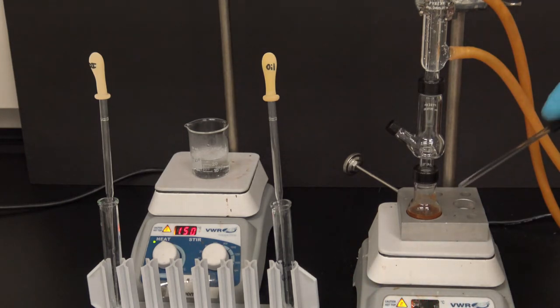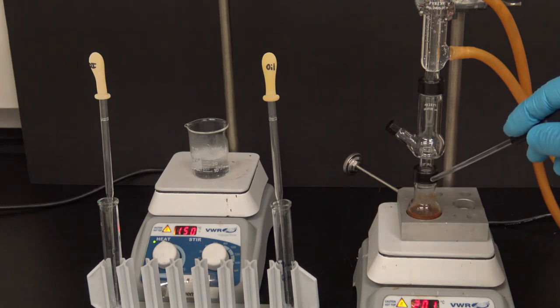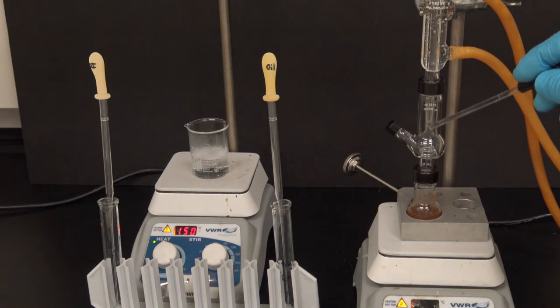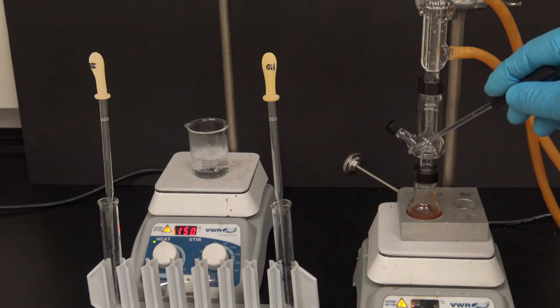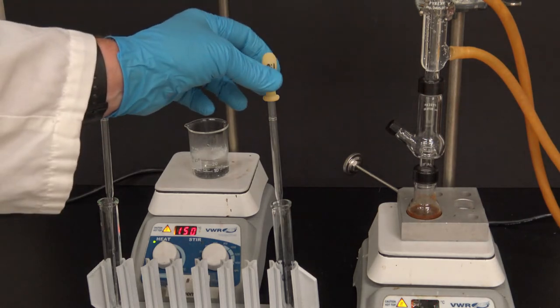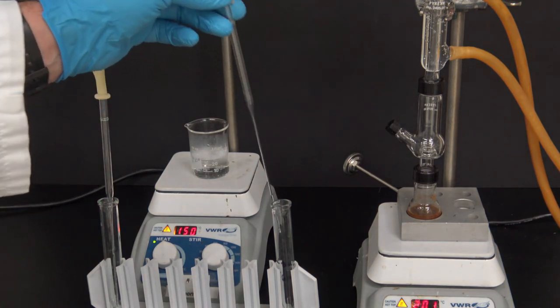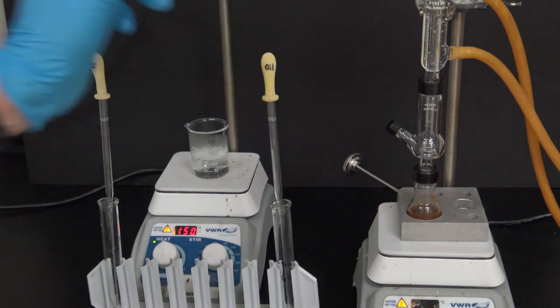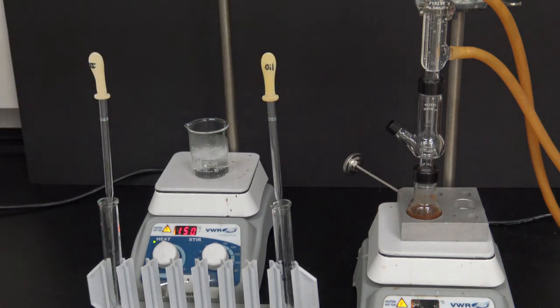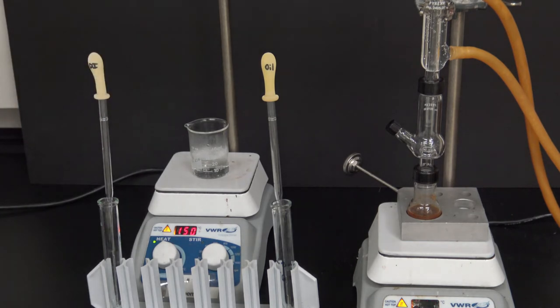So what's going to happen is I'm going to distill water, and as that water comes up, it's going to drag some of the essential oil up also and condense down and collect in my Hickman still. At that point, I'm going to take my pasteur pipette, stick it down in the sidearm, and remove it and put it into my conical test tube, and then get some water and replace that amount of water down through the top. So let's just sit back now and wait for it to start to boil.